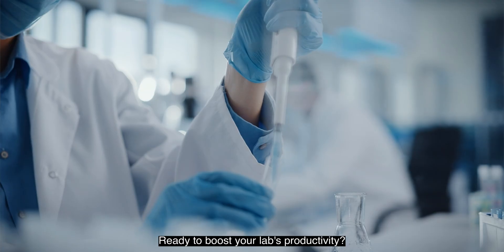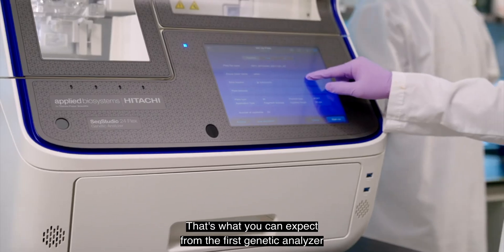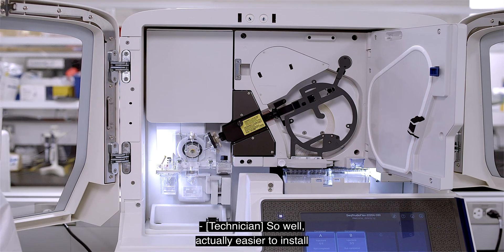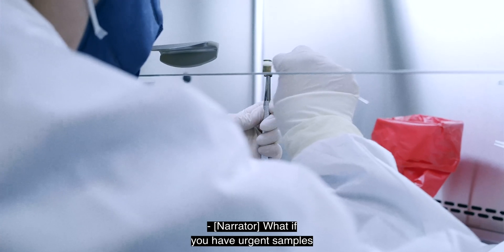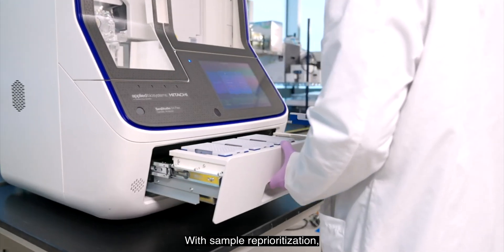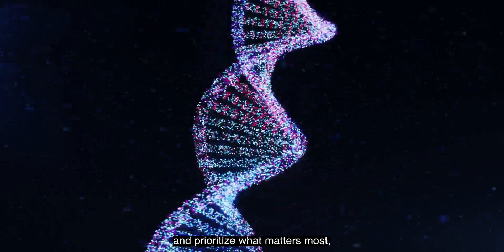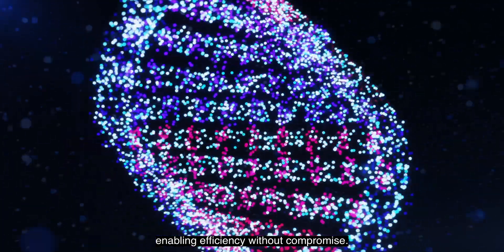Ready to boost your lab's productivity? We're talking uninterrupted, 24/7 use — that's what you can expect from the first genetic analyzer that allows you to continually load plates. So actually easier to install than even the 3500. With sample reprioritization, you decide which batch of samples are injected next, allowing you to take charge and prioritize what matters most, enabling efficiency without compromise.